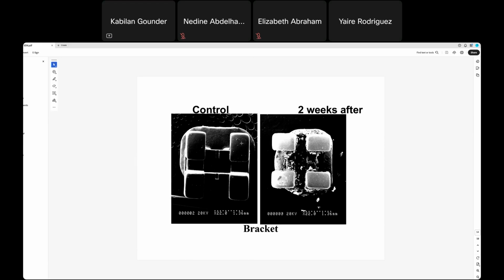So as I mentioned during the process, this is a metal, silver, but my question to you is whether this requires fixation or not. As I mentioned earlier, if there is no bacteria you are looking for, then there is no need for fixation.